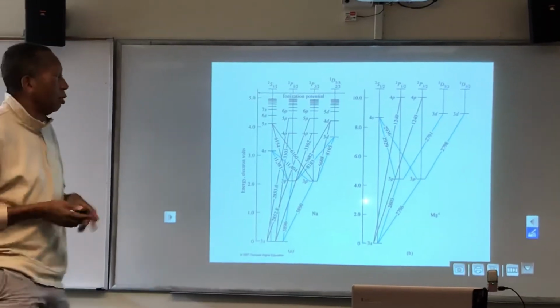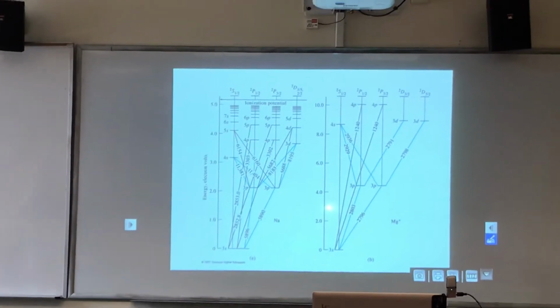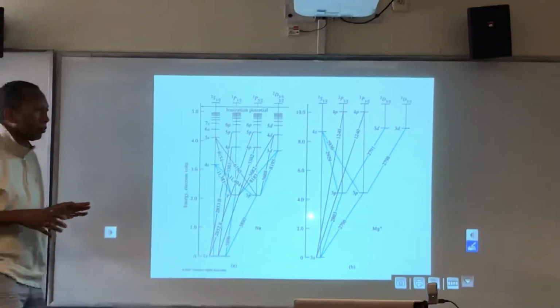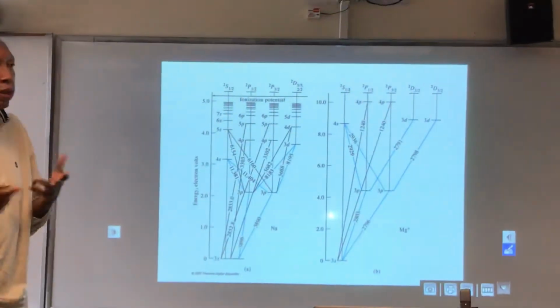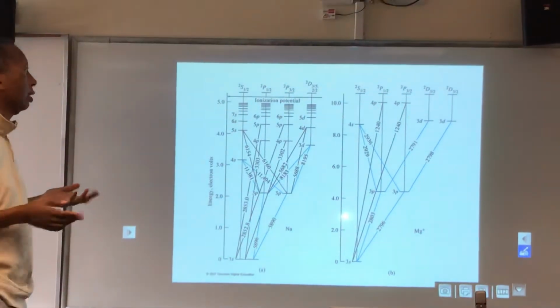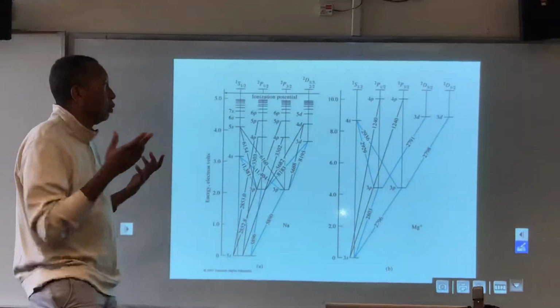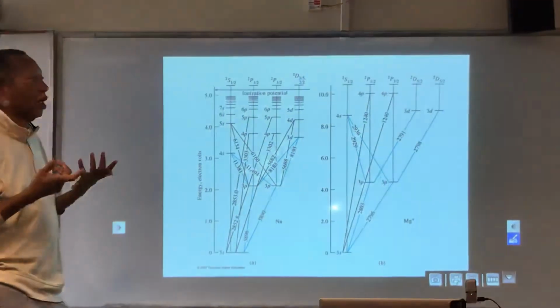So I'm starting at the beginning of atomic spectroscopy. And if you remember, molecular spectroscopy was the experiment we did with cobalt and chromium, where we had these large absorption bands, right? The bandwidths of the absorption bands were large, maybe 40 nanometers wide, okay?